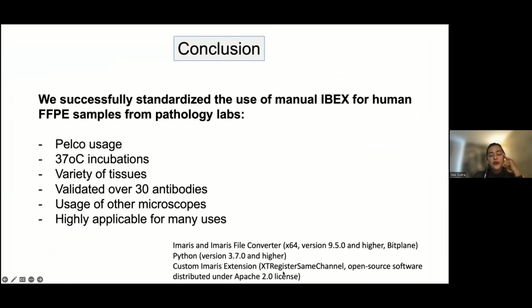I put down here for you, but this is also more clearly presented in Andrea's papers, the extensions and the free programs, which are the Imaris reader and the extensions and algorithms that Ziv developed that you can use for analyzing these samples. So we are now in the process of analyzing this. As you can imagine, this generates a huge amount of data, so it will be a while before we have all the cells, frequencies and intensities analyzed, but we are in the process of doing that.